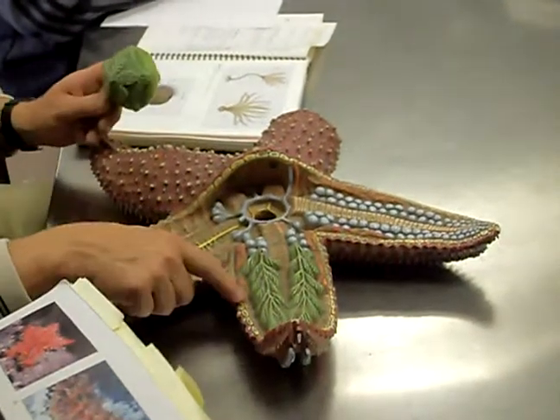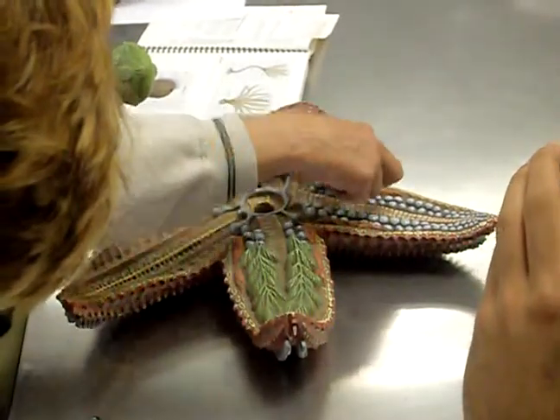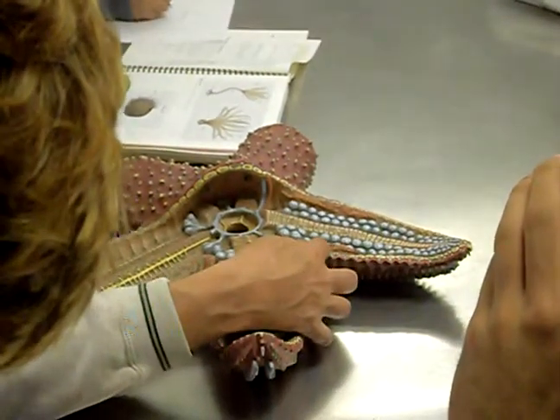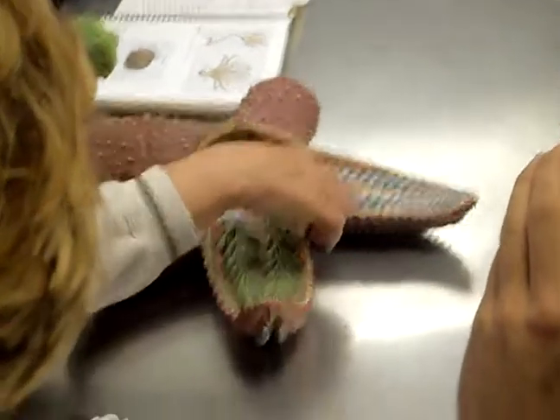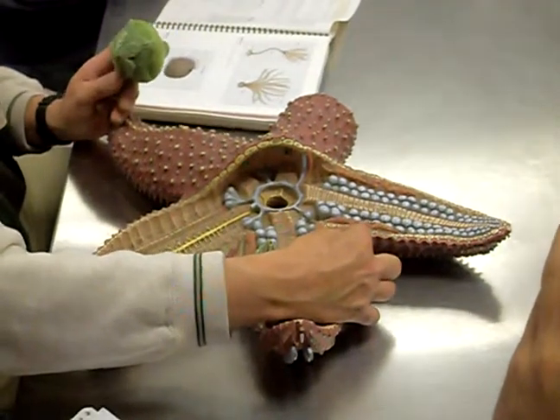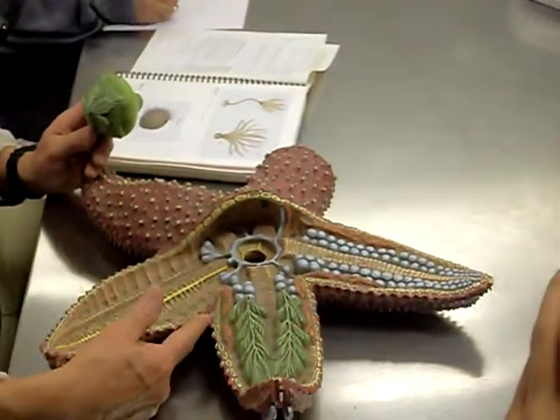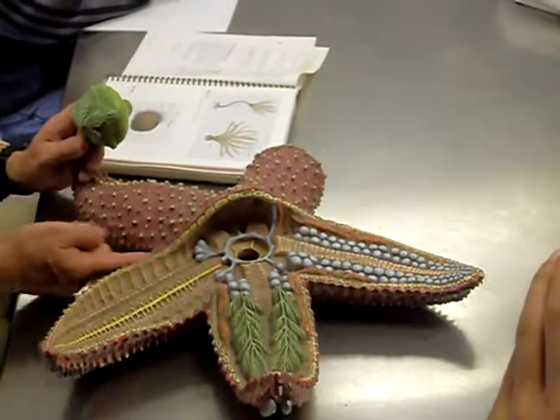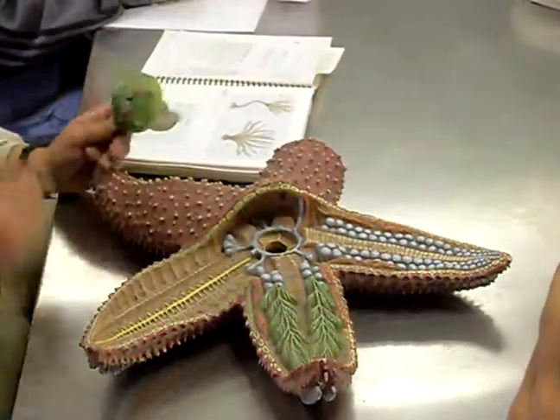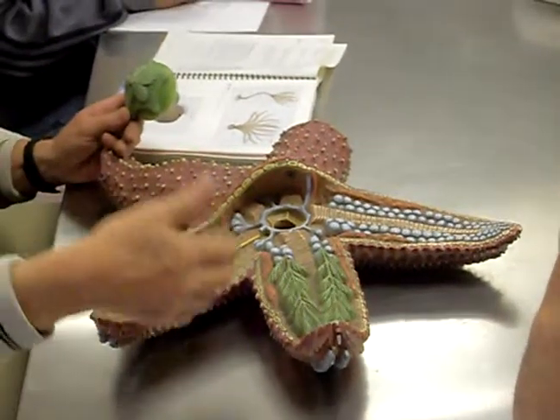One more thing: you can see the gonads located here. There is a pair of gonads in each arm. The gonads from two adjacent arms share a little oviduct, which opens at the crotch where those two arms meet — an oviduct opening if female, or a sperm duct opening if male. So eggs or sperm come out at those junctions. You have five gonopores total where either eggs or sperm exit to the outside.